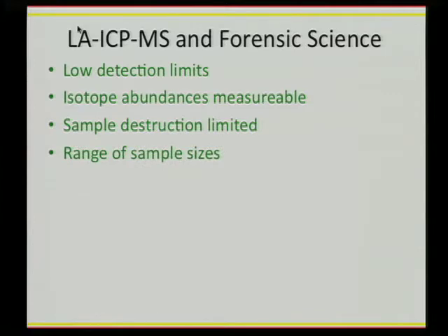We can look at a range of sample sizes. There have been recent advances in laser ablation, but for our sake, we can only look at samples that fit into our laser cells, so it's about 2 inches in diameter.